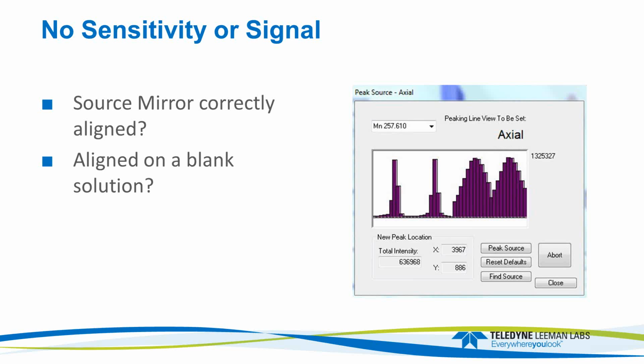So this is a time it's really helpful if you have that screen capture of the diagnostic. You can see what it should have been, and you just easily go back there and enter those values in and get back to where you belong. Or on this particular dialog, if you have an instrument, there's a reset default, and that'll go back to whatever positions are entered into the instrument's configuration file when you boot the instrument up.